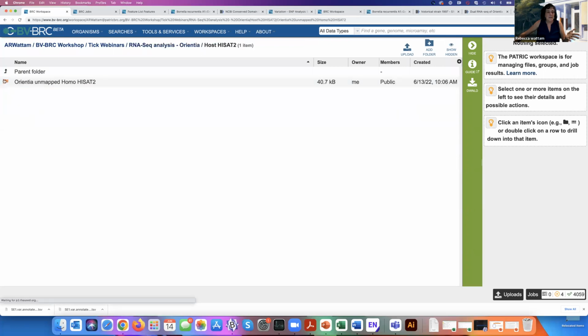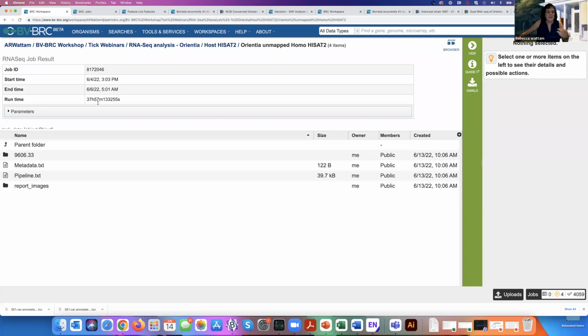So the more stuff you put in there, you're playing the odds. This ran 37 hours for that human genome, and it was still completed, right? It didn't fail, and as we get more data, if we start getting a ton of these going in and mapping against the human genome, then we will start allocating more memory for it because we'll have more experience with it.